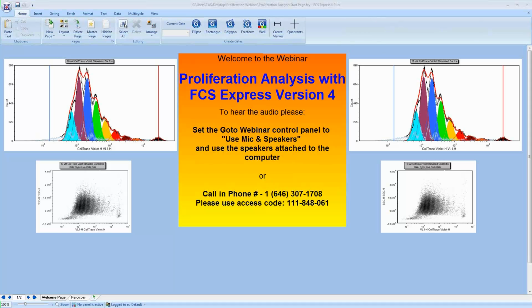So today we're going to cover proliferation analysis with FCS Express version 4. We're going to try and do that in the next 30 minutes. FCS Express makes this type of analysis very easy, and that's what's going to let us teach you how to do this in about 30 minutes.